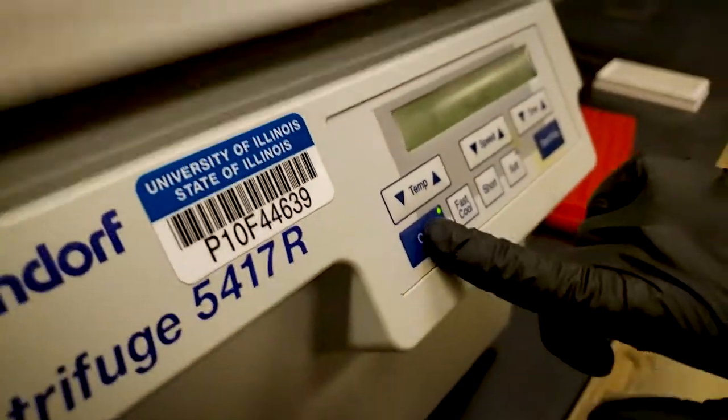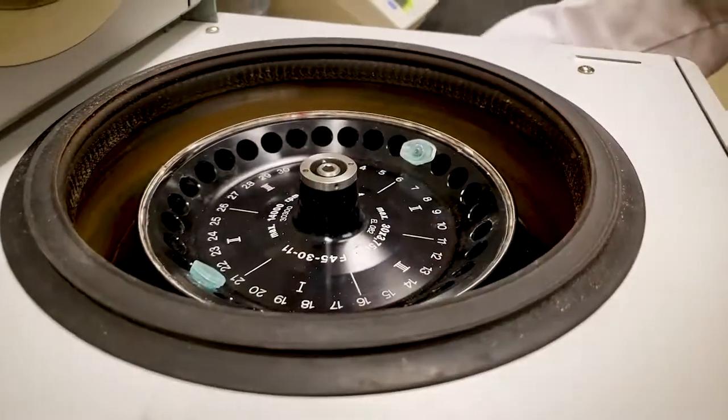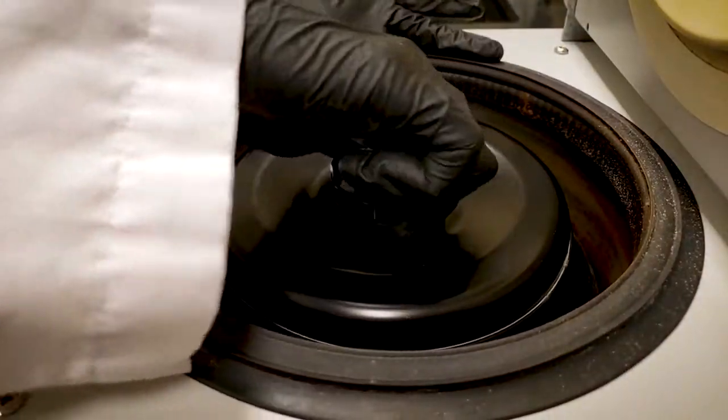Centrifuges are used to separate liquids based on density. So when you spin a liquid down in a centrifuge, the particles with the highest density will fall to the bottom of the tube, while the particles with the lowest density will remain at the top.